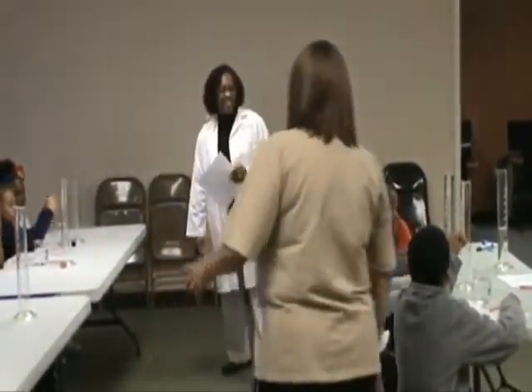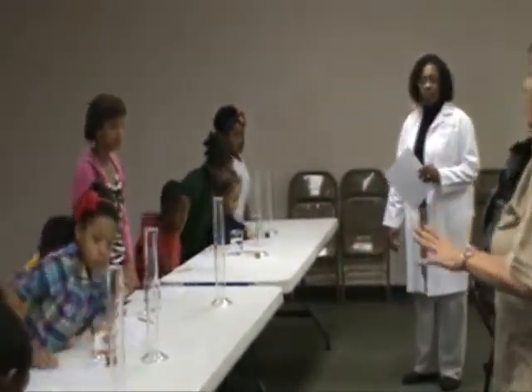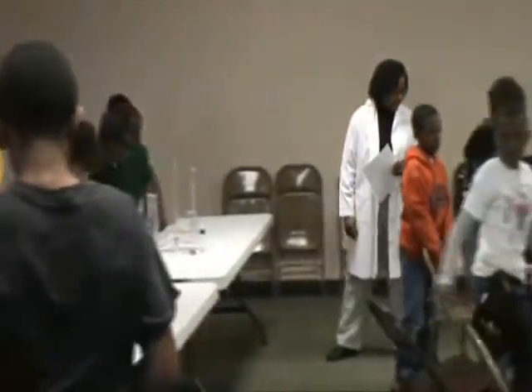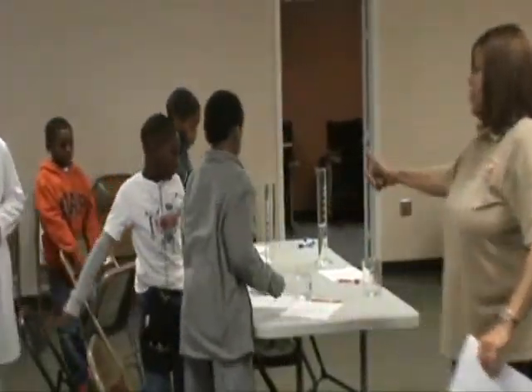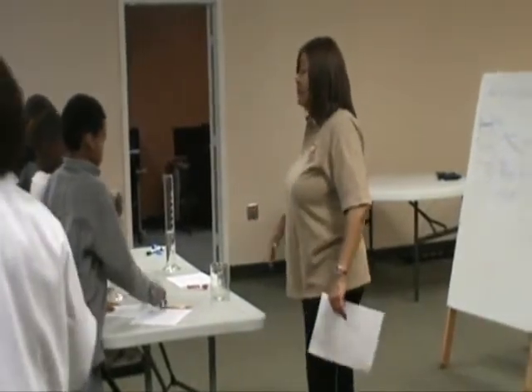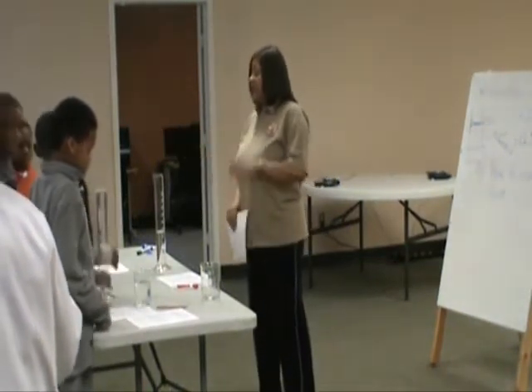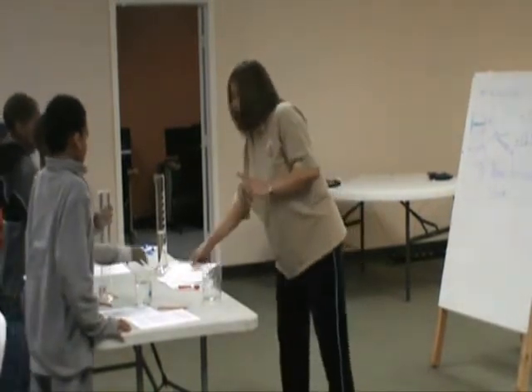At this time, I want you to stand up and put your cylinders in front of you. Push your chairs all the way back. Don't do anything, follow instructions. Good. Push your chairs back, because in the lab right now, you're going to be up and working. That's perfect. At this time, using your beaker, the way I showed you.